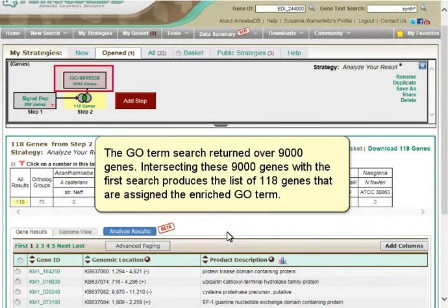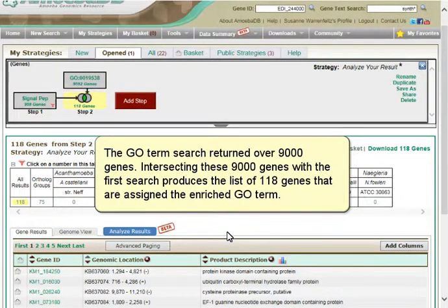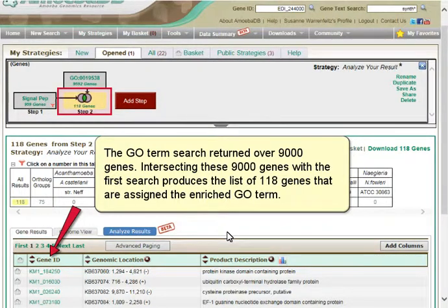The GO term search returned over 9,000 genes. Intersecting these 9,000 genes with the first search produces the list of 118 genes that are assigned the enriched GO term.